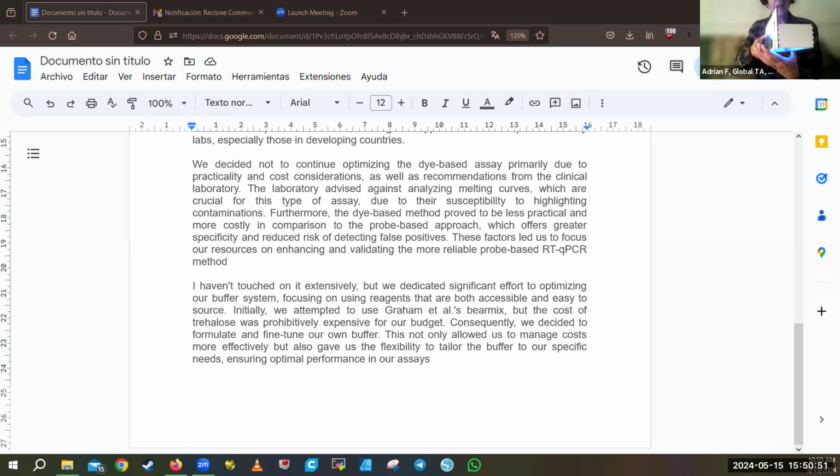So the board looks like this, and the top looks like this. If you put the top on, you can put your cell phone in here. You will get the light in here, and it goes perfectly over these holes. They will go over the cables.